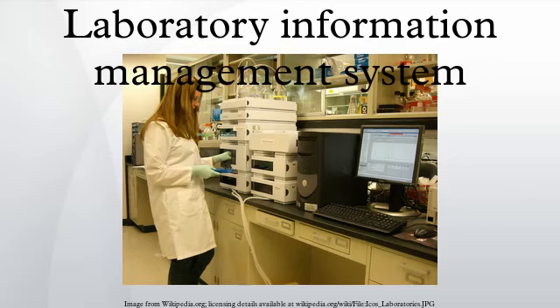LIMS has utilized many architectures and distribution models over the years. As technology has changed, how LIMS is installed, managed, and utilized has also changed with it. The following represents architectures which have been utilized at one point or another.